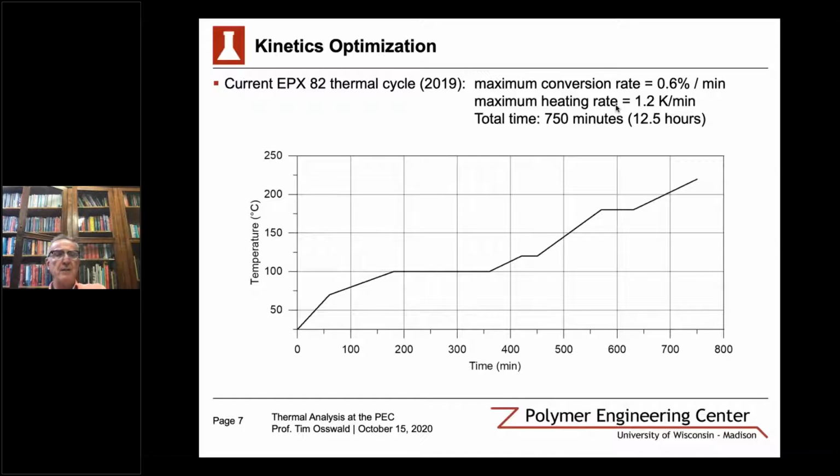This is done for two reasons. One of them, we don't want to heat it too fast and soften the material before it starts thermally curing, and start sagging, and the other one is you don't want to create high residual stresses during the curing cycle. However, a view into the actual reaction, the thermal aspect of this reaction had never been done, and so we figured this very long curing cycle, almost 13 hours, is unacceptable for industrial applications.